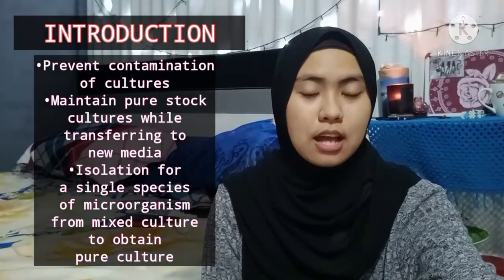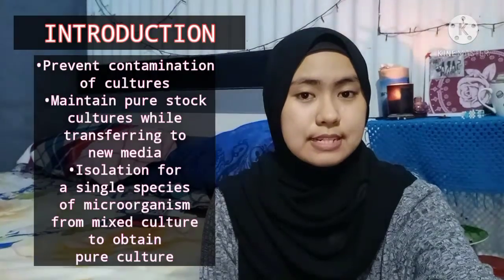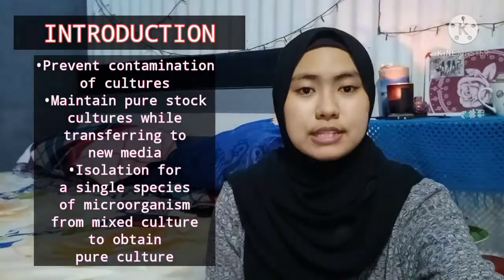So now I will start with the introduction. Aseptic technique is a technique used to prevent the contamination of cultures from the foreign bacteria contained in the environment. It is very important to prevent the culture from being contaminated because it may later affect the result. This technique is very important for microbiologists because it is widely used for a variety of procedures such as transferring cultures, inoculating media, isolation of pure cultures, and also when performing microbiological tests.